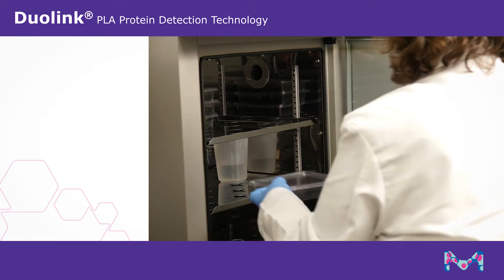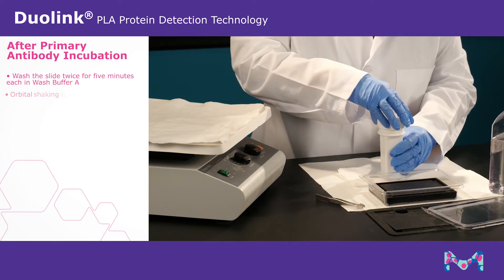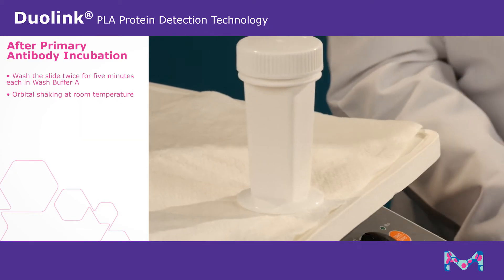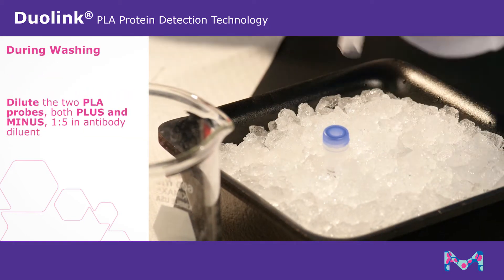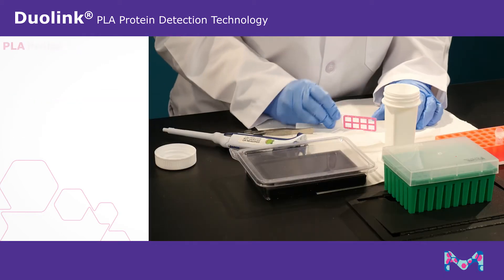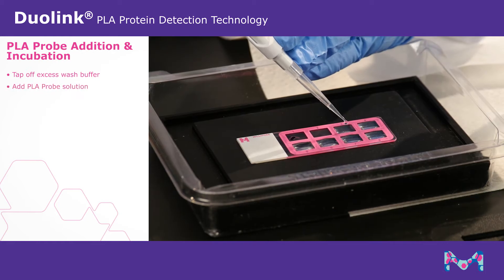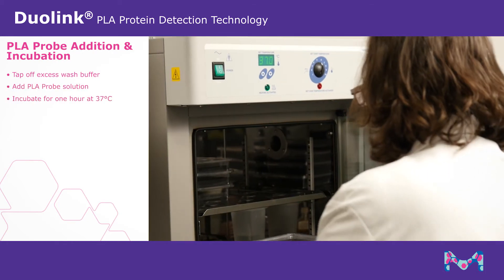After incubation, wash the slide twice for five minutes each in wash buffer A with gentle orbital shaking at room temperature. During washing, dilute the two Duolink PLA probes together 1 to 5 in antibody diluent. Tap off excess wash buffer and add the PLA probe solution to each well. Incubate for one hour at 37 degrees Celsius.